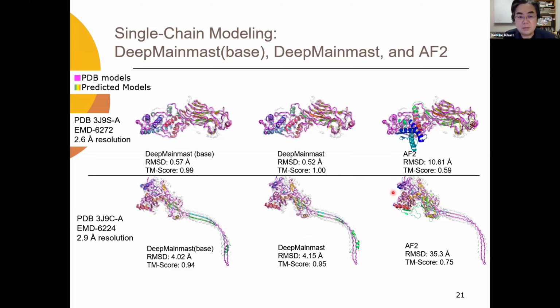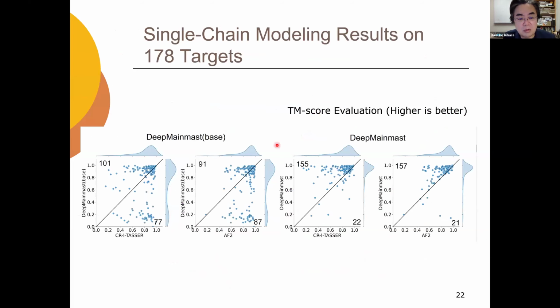And this is the overall comparison between DeepMainMast and AlphaFold, tested on 178 CryoEM maps.